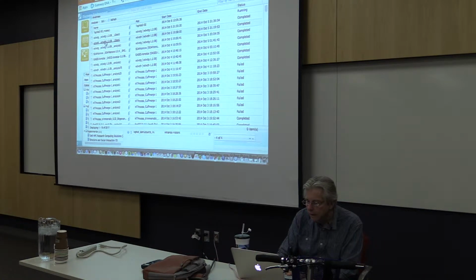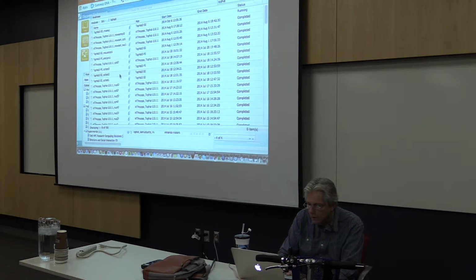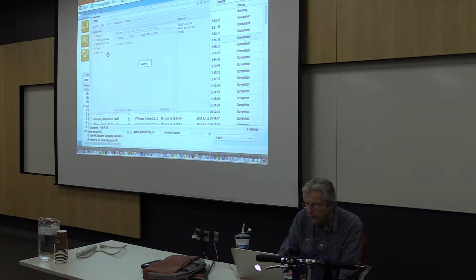And if you want results of other things that I've run, let's take a look at other TopHat runs. Here's one that I did with mouse. Let's see how that one did.